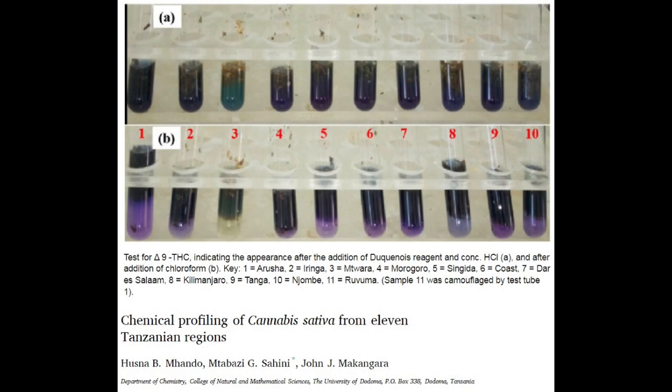A3, the DL reagent is an interesting one. This reagent is used to test suspected cannabis for THC. And by cannabis, I mean the actual plant material, not some synthetic product. Although this test may work on them, usually THC comes as gummies or vapes, which have a lot of additives that could interfere with the test. Because this test is done with actual plant material, it is always carried out in test tubes.